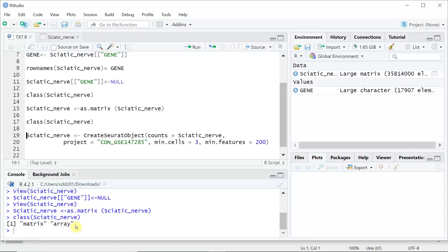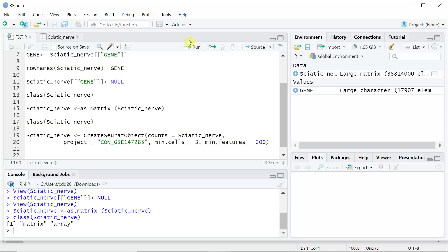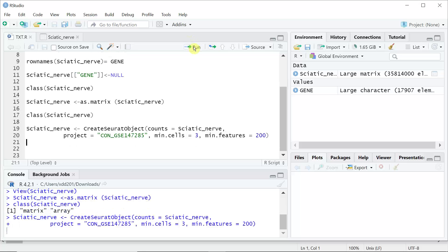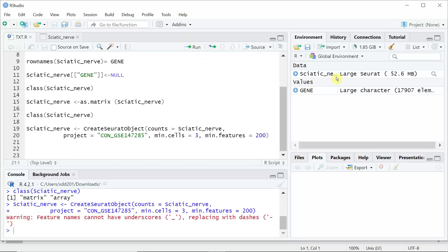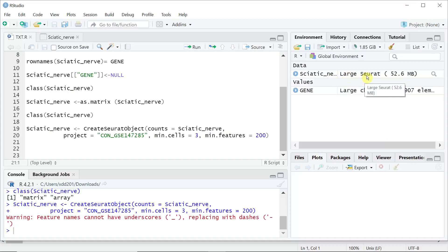Now we can use the CreateSeuratObject function to create a Seurat object. If we run this function, you will see the data change from large matrix data to a Seurat object.